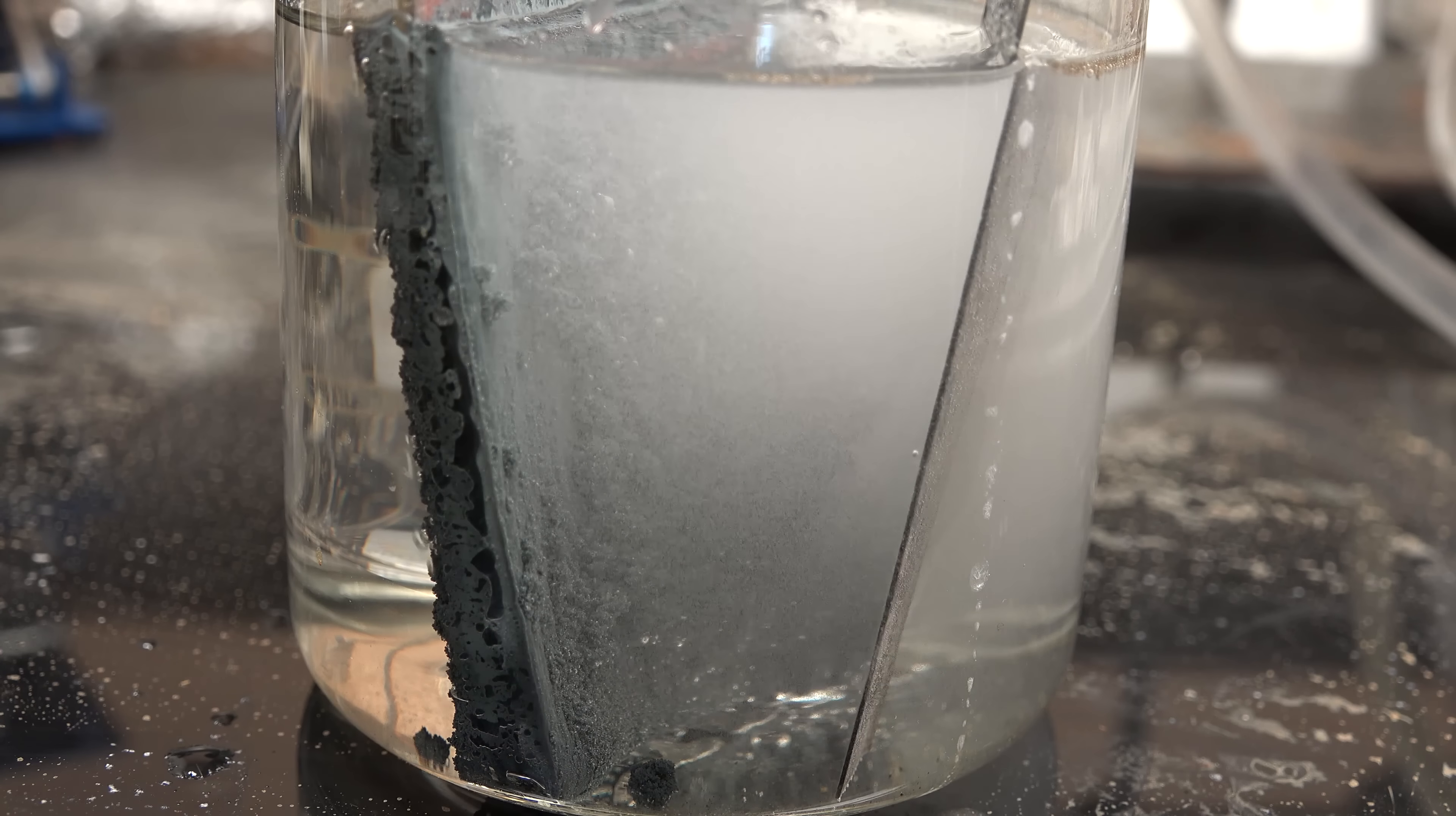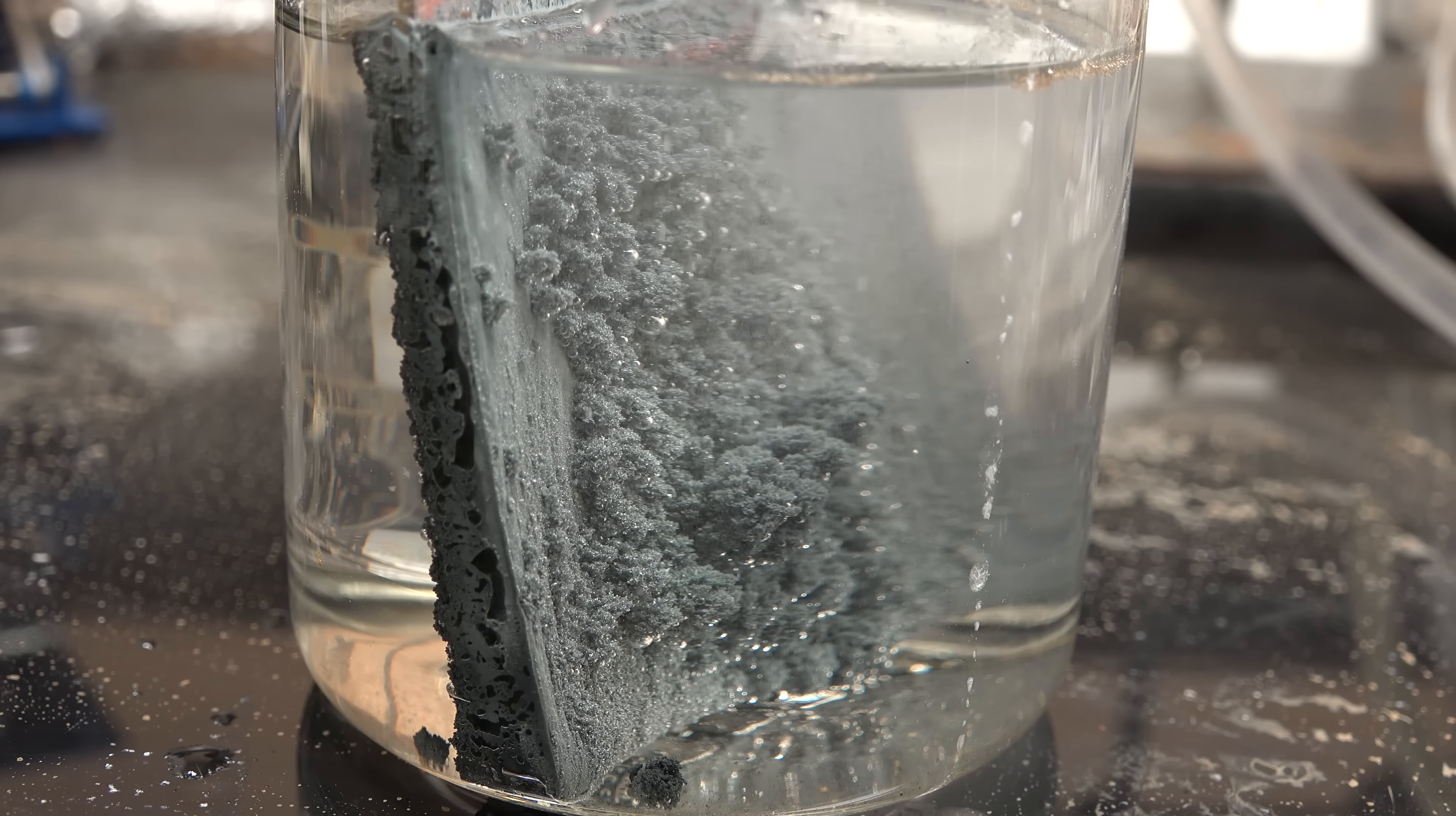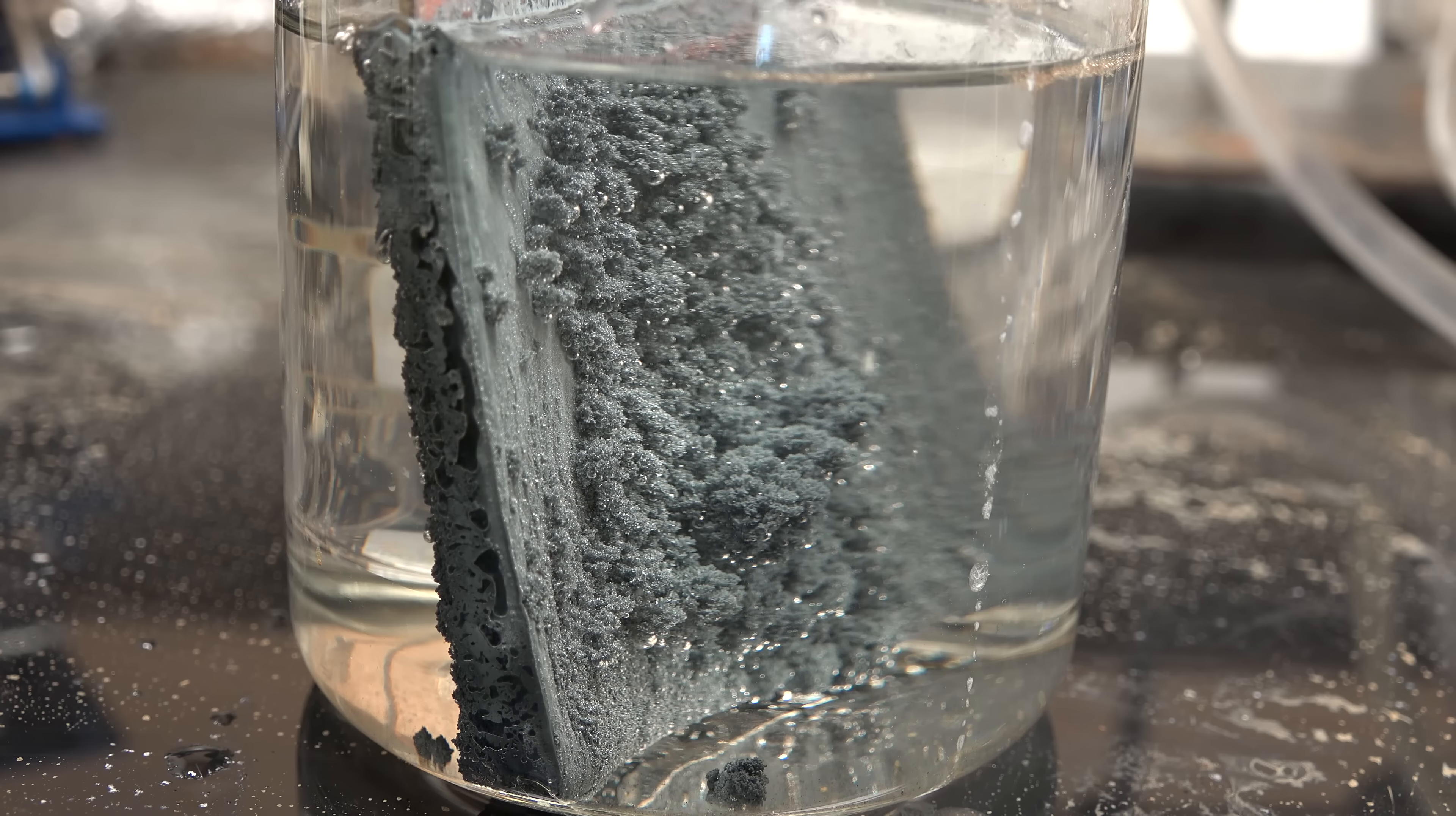And here we are the next day. Let me turn off the current and remove the nickel anode so you can see what we've obtained. So we have a nice thick deposit of zinc. You'll notice that even though we've turned off the power and removed the anode the zinc is still bubbling.